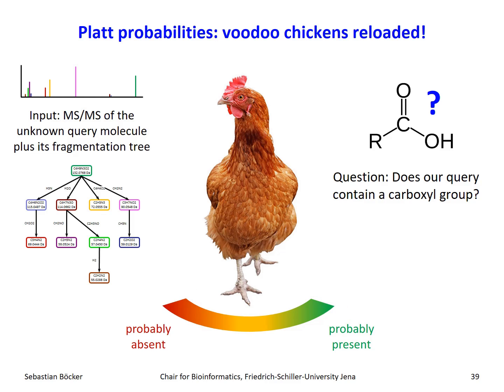On the machine learning side, this is the posterior probability of the molecular property that we are predicting, and we use a Platt estimate to predict that. Since the words Platt estimate of the posterior probability are too long, we often use something shorter like Platt probability or just Platt estimate or just posterior probability. That's all the same. One is the technique we use to compute it, and the other is actually what we want to compute, the posterior probability.